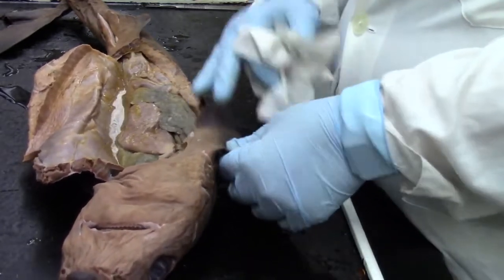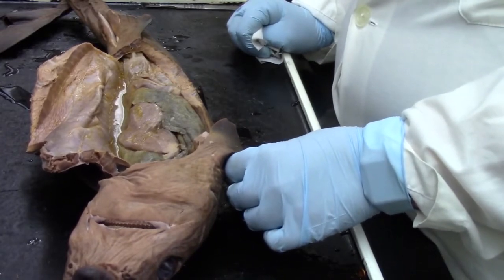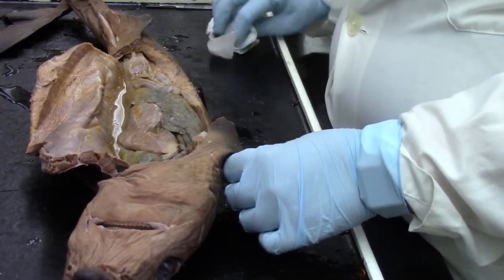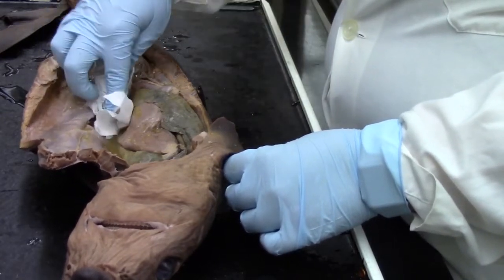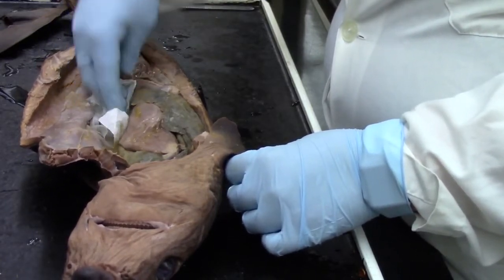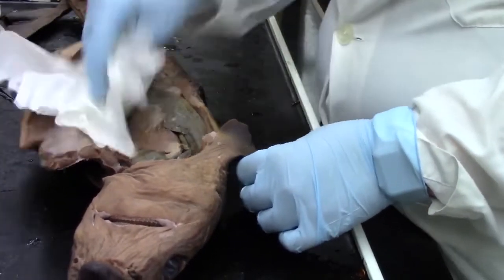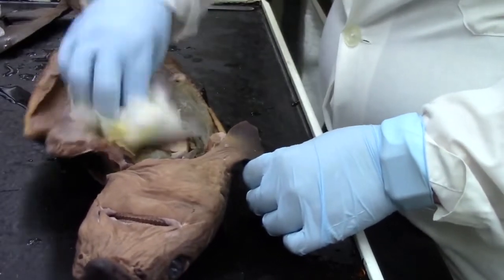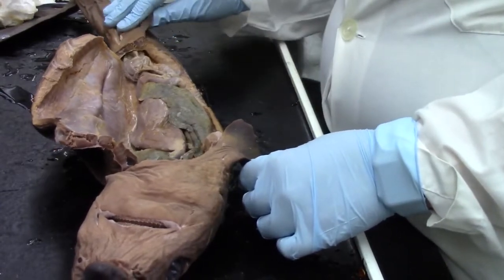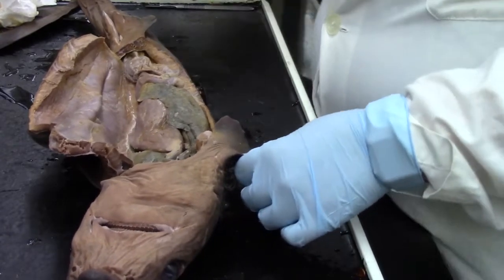You can do this in many different ways. One way that I find really efficient is to just take your specimen over to the sink and give it a quick rinse. Another thing that can work quite well is to just insert paper towels and absorb it out of there. Okay, now that we've got the shark open, I'm just going to change its orientation and start walking you through the internal anatomy.